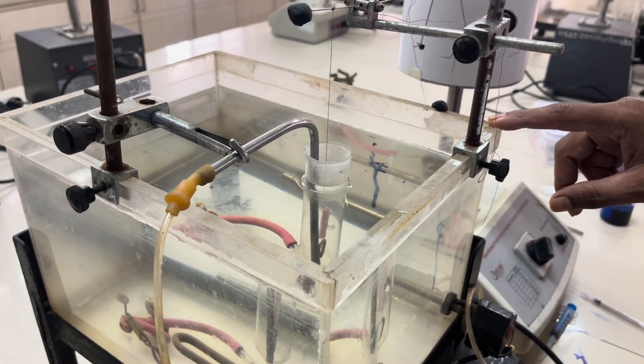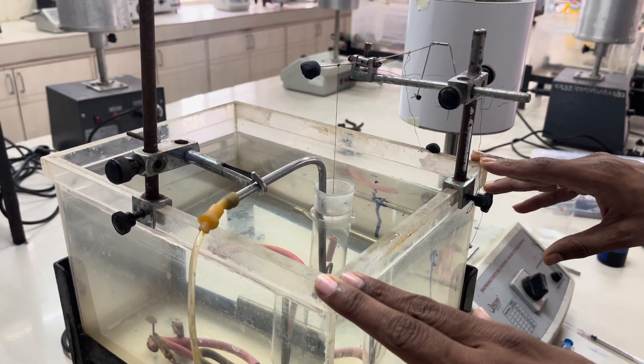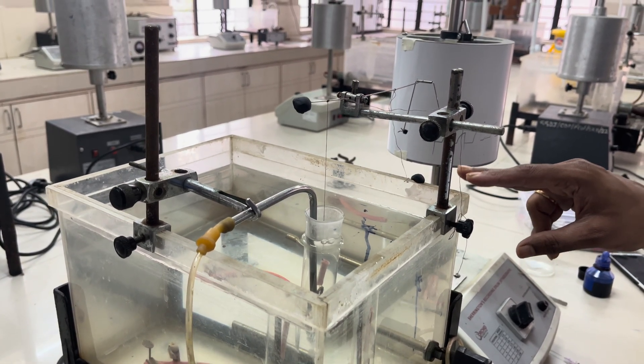Today we are going to see how the setup is done to get proper responses by using isolated tissue preparation.